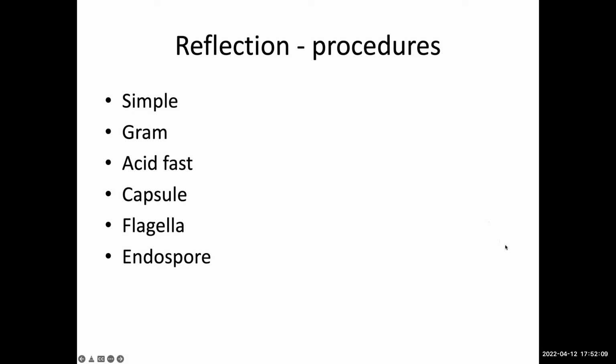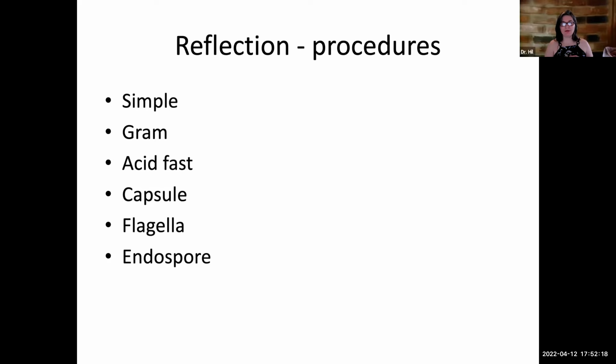I know you prepare the slide and use crystal violet. Yeah, that's absolutely one way to do it. You prepare the slide and then you use a dye. It could be crystal violet. It could be anything, really. It could be methylene blue. It could be safranin. A simple dye, and then you just rinse it off and there you have your cells. Excellent.